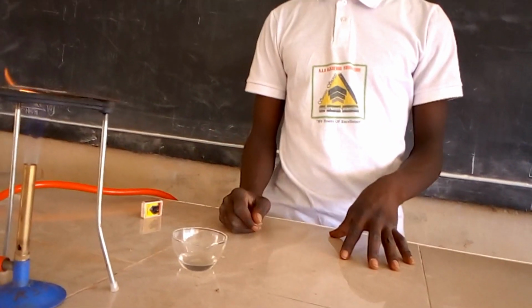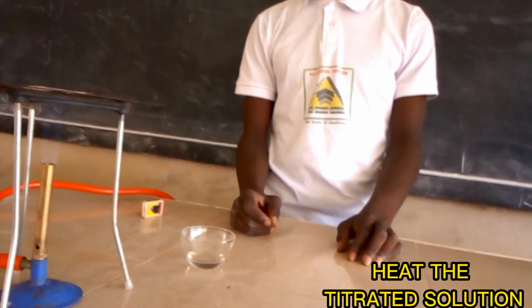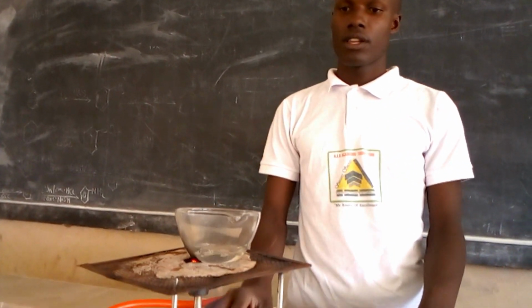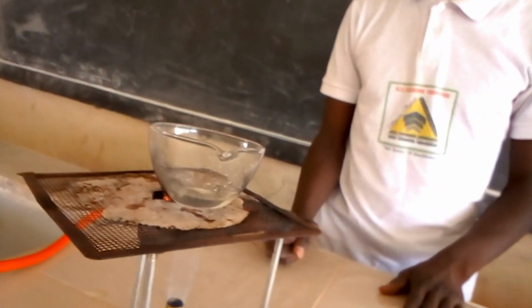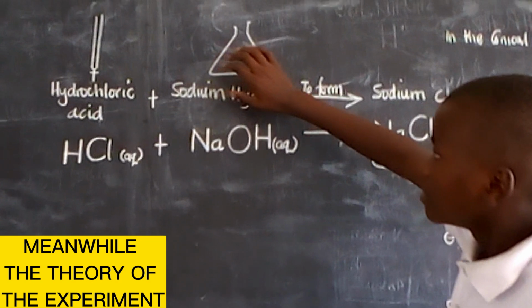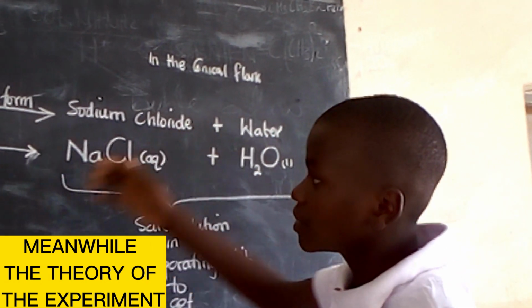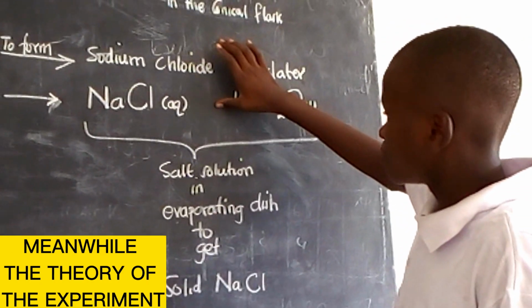We shall now put the titrated solution in the evaporating dish on the source of heat. We are heating the titrated solution so that the volume reduces to half. We added hydrochloric acid from the burette to sodium hydroxide in the conical flask to form sodium chloride and water. So this is the chemical equation of the experiment. We are heating this solution so that we can get salt.